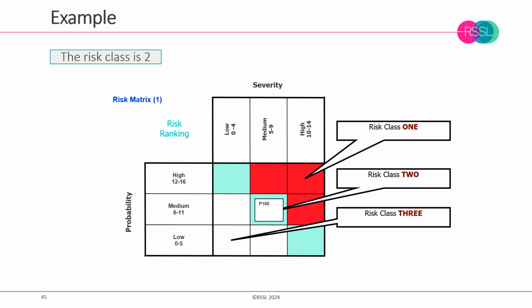And then we need to say, okay, what do we have in terms of detection? Well, in this particular case, we have the environmental monitoring in the room, and we also have the ability to take a sample of the chemical buffer that's being prepared, so we can take an in-process sample.